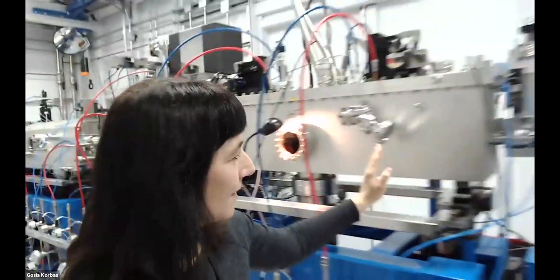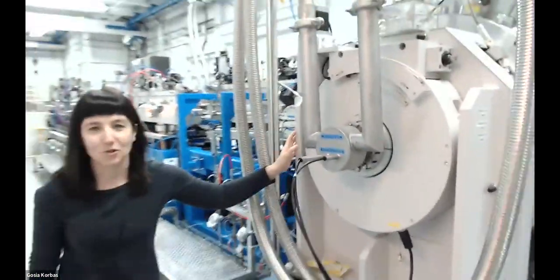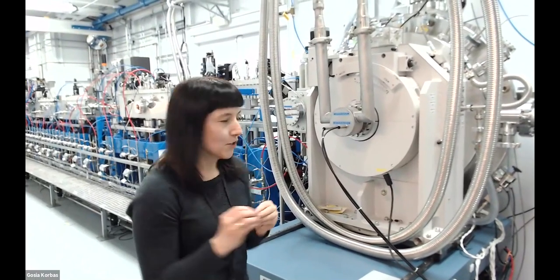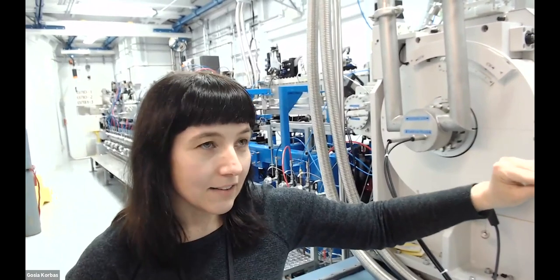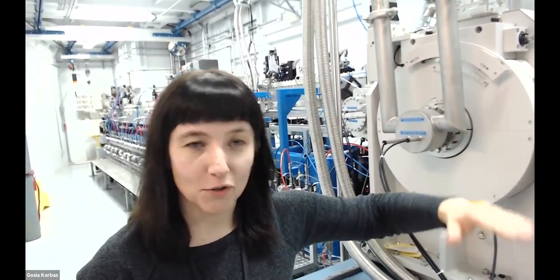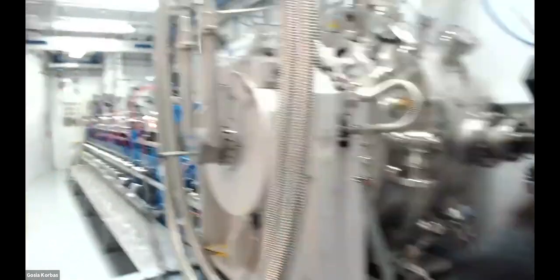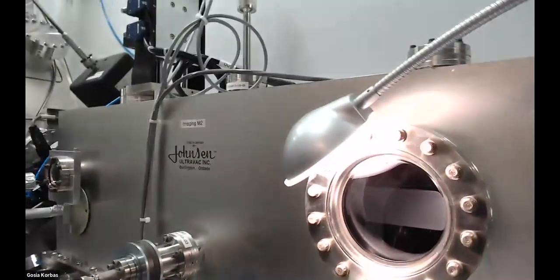So now let's follow X-rays again. So another beam pipe here, and this is the big monochromator. That's quite a big structure here. And this is for us to really only take a very narrow energy range. Up to this point, we have quite a broad energy range of X-rays, but we don't really need it for most of our experiments. So we use the monochromator to just take a small portion out of it. And this is not a constant setup. We can change it. Depending on what elements we are interested in, we'll change the tuning of this monochromator. So now you can definitely see here that the beam is not so powerful because the viewport is completely transparent. It's just pure normal glass.